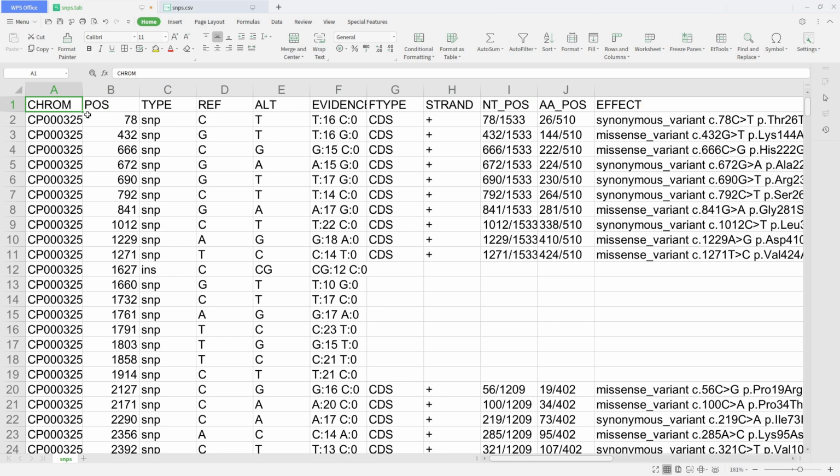With pandas, it will just use the first row as the header, so that one is not part of the data. But the others here, these are rows. Those ones will be part of the data. So take note, these are headers, so these are the columns. Python will just give you that info. I think we have about 14 columns, but we will do everything on the Python terminal. So let's proceed. This is just by the way.